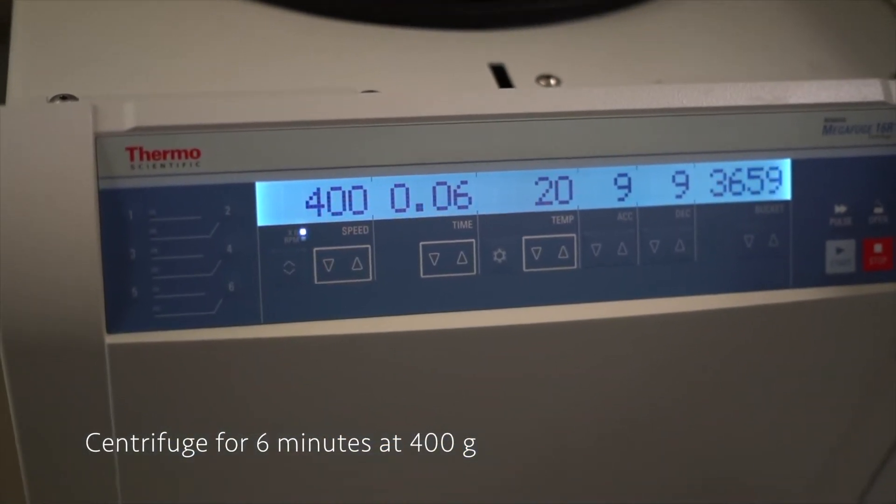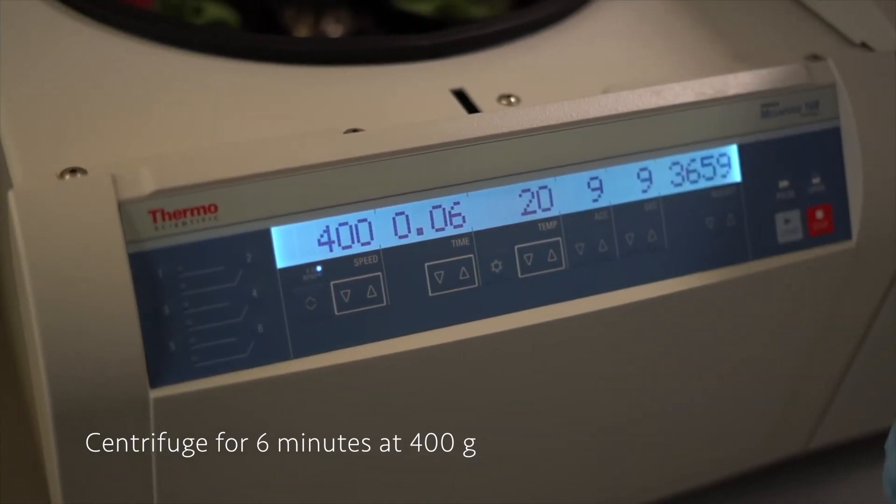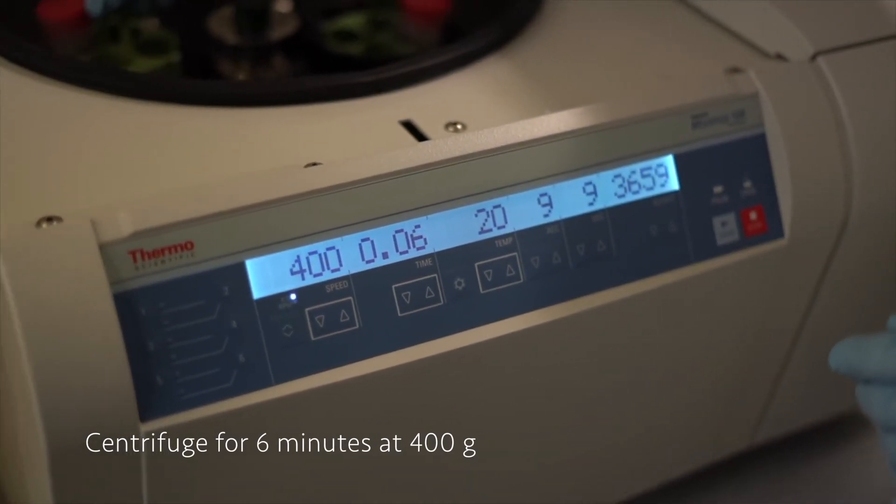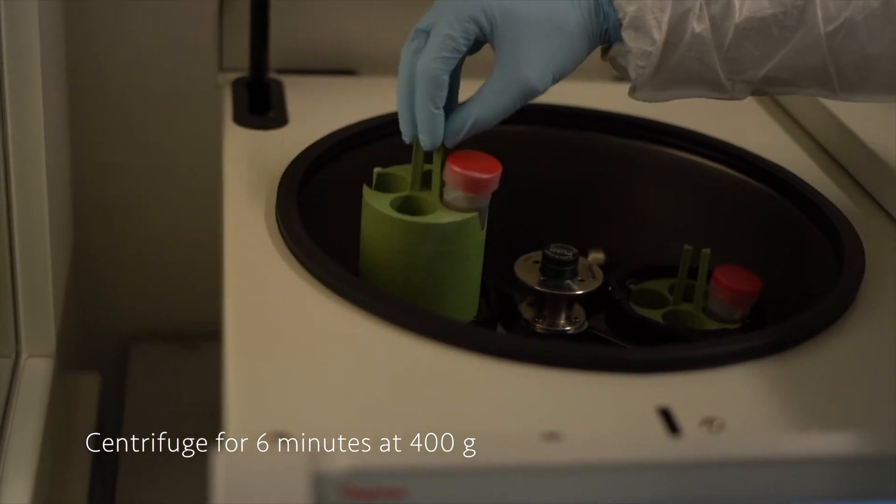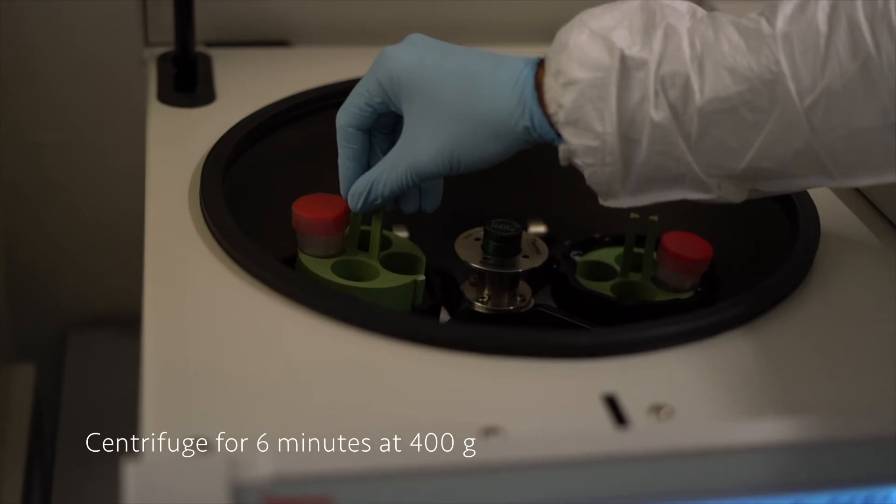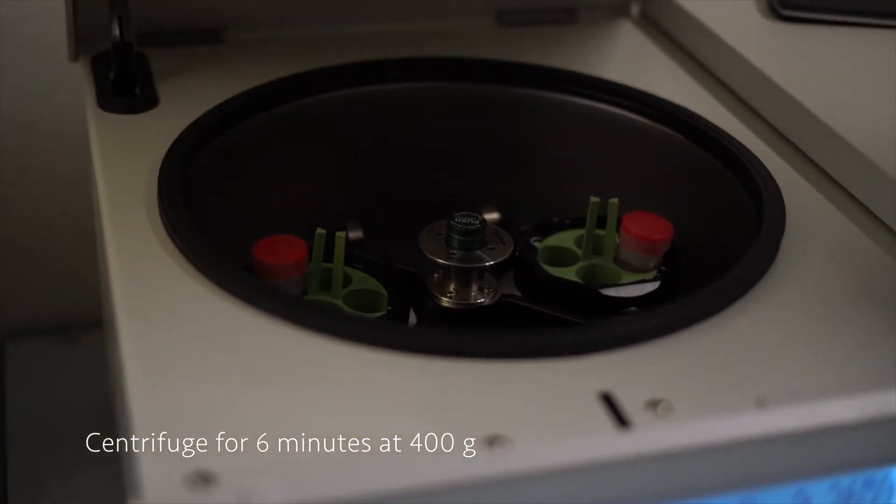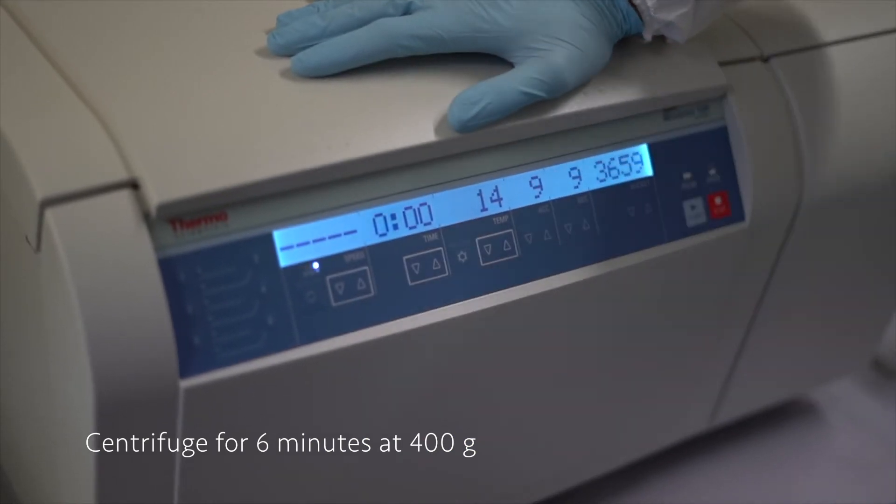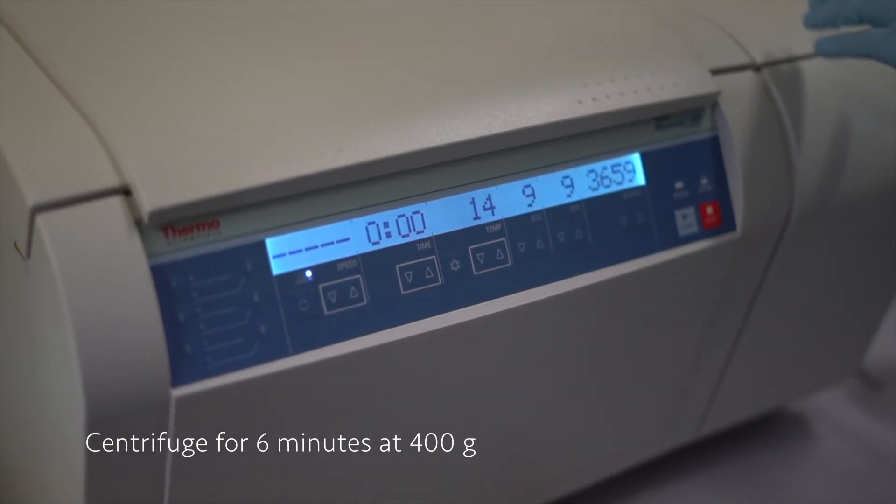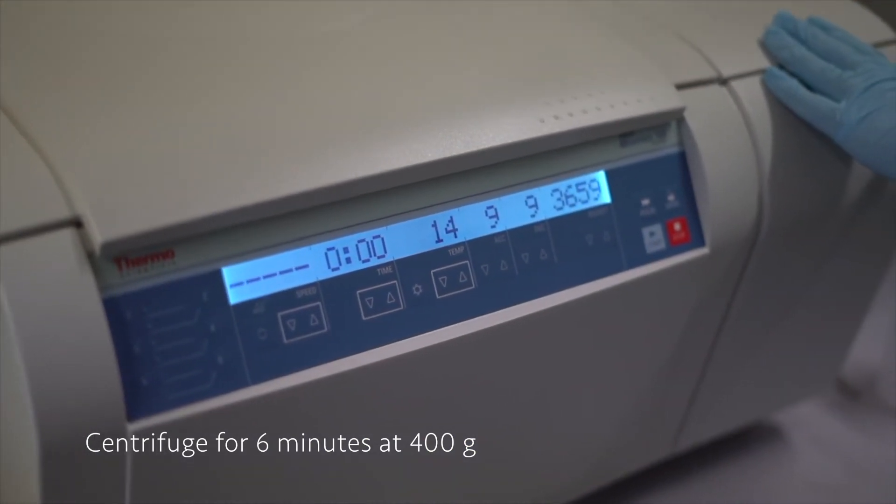Alternatively we can also centrifuge for 4 minutes. Then if we want we can turn the tubes 180 degrees and then continue for the remaining 2 minutes. We are going to centrifuge it simply for 6 minutes at 400 g, and then see if everything has flowed through the MinElute column.